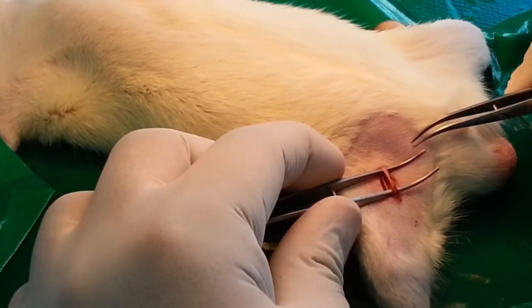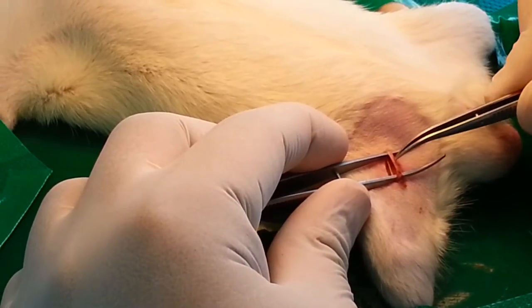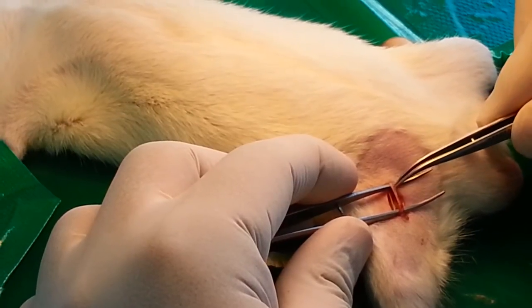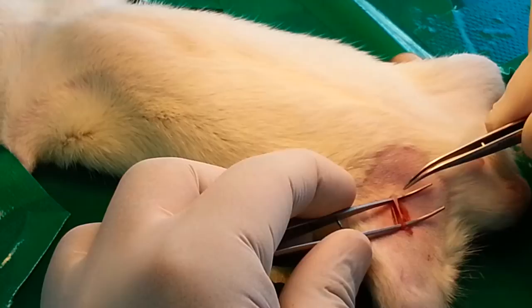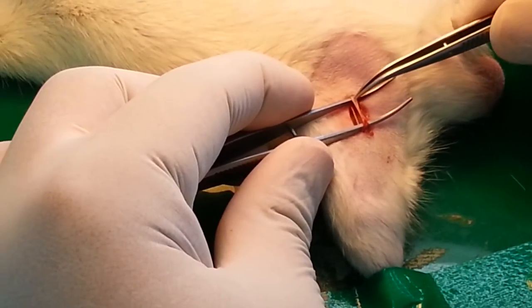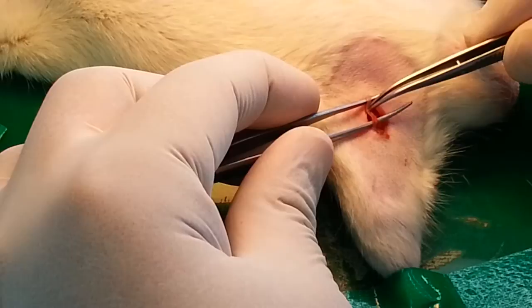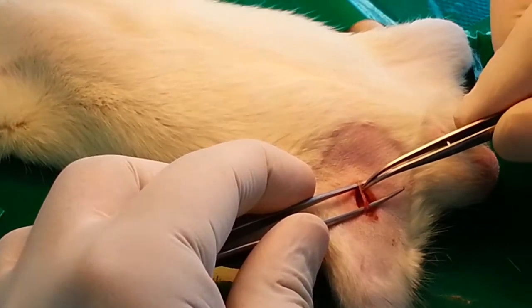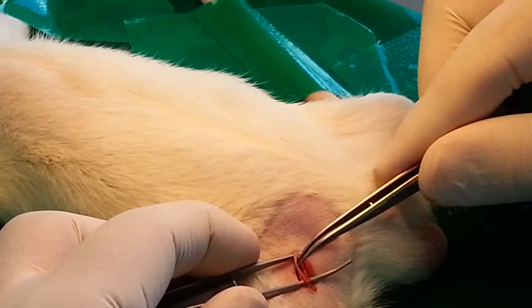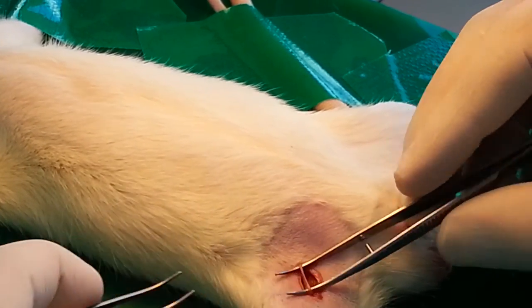Since we are doing cannulation for the artery, we need to separate the artery and vein. You need to be very careful because a small prick can make a big damage. The one with the red color is the vein and the other with a whitish or yellowish color is the artery. We need to separate the artery and the vein. Now on top of the spatula is the artery, while below in red color is the vein.